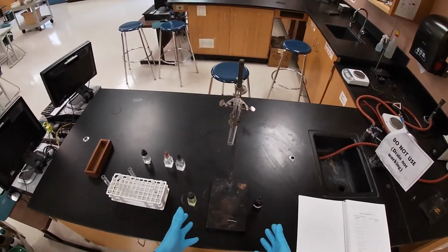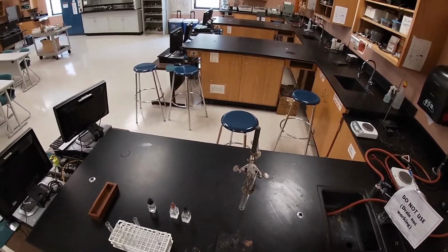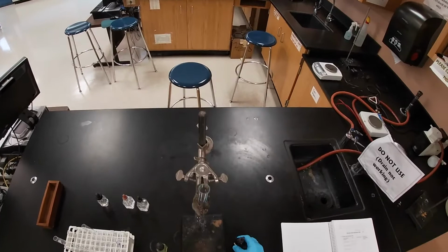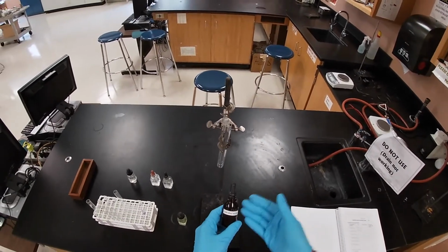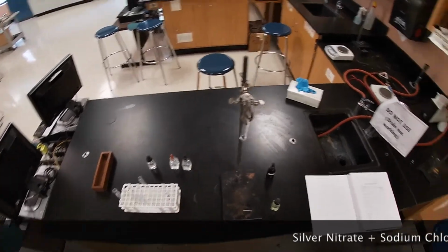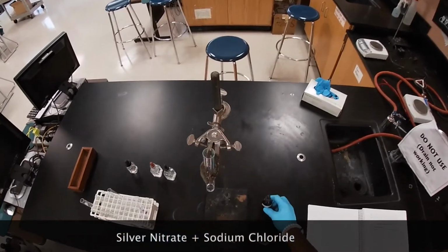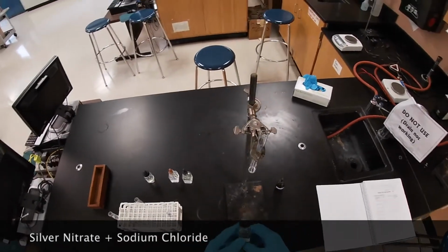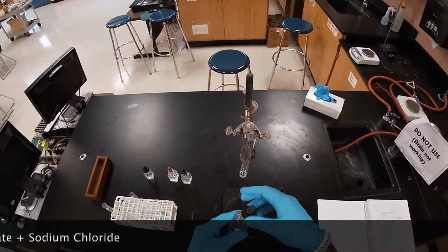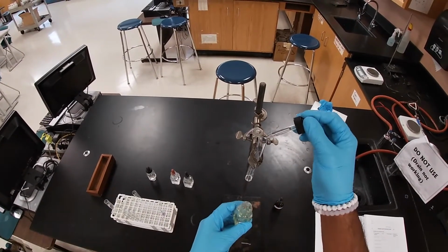Here we have solutions that are soluble in water, and within those solutions you have a bunch of floating ions. We're going to add a dropper full of solution. Okay, so we went ahead and added our silver nitrate into our test tube. The next thing I'm going to do is add some sodium chloride, and as I add it, we're going to determine if a precipitate is formed.